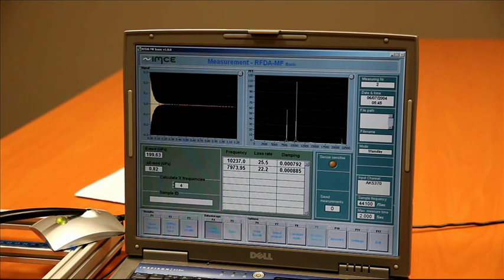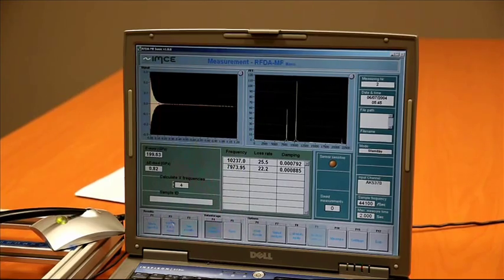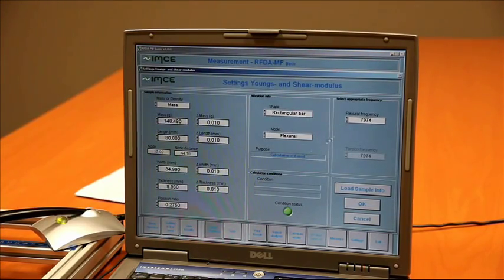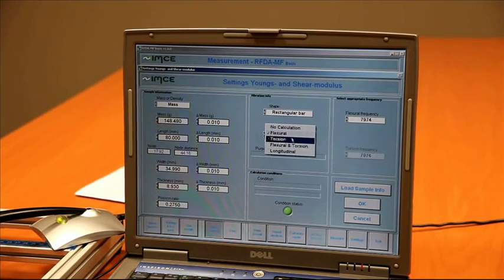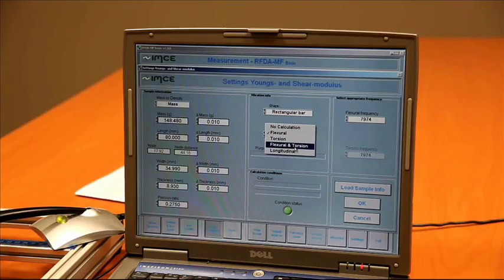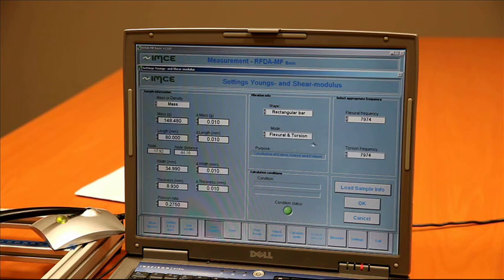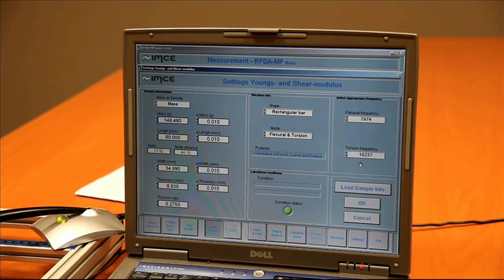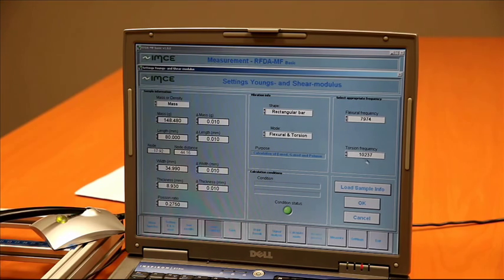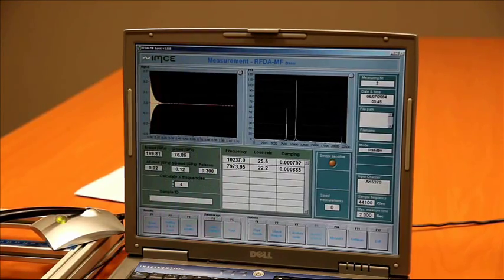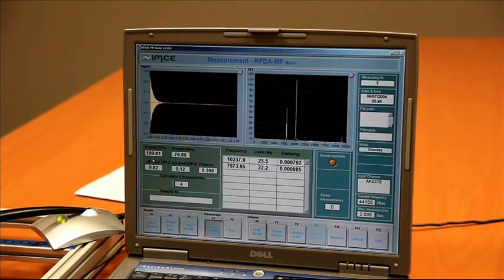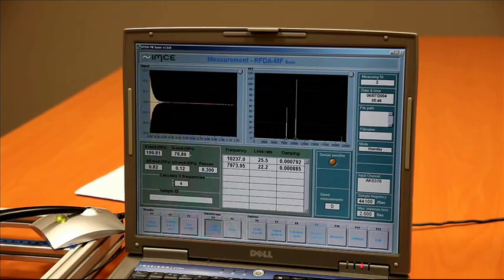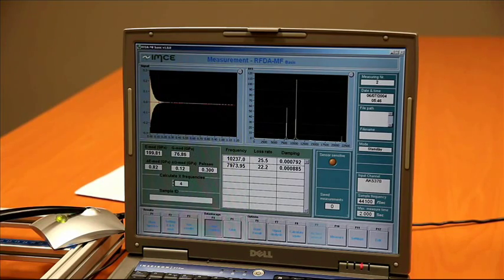Now, to calculate the shear modulus and Poisson ratio, we have to say that we measure flexural and torsion. We select the correct torsion frequency, and the software calculates the Young's modulus, shear modulus and Poisson ratio.